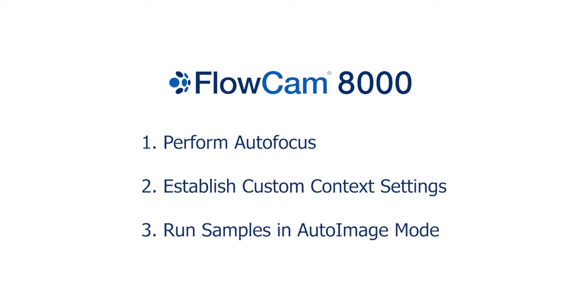In the first part, we will describe how to autofocus the FlowCam 8000 optical system using standard beads. Next, we will describe how to establish custom context settings using standard beads just for demonstration purposes. And lastly, we will describe how to run samples on your FlowCam 8000 using auto image mode.